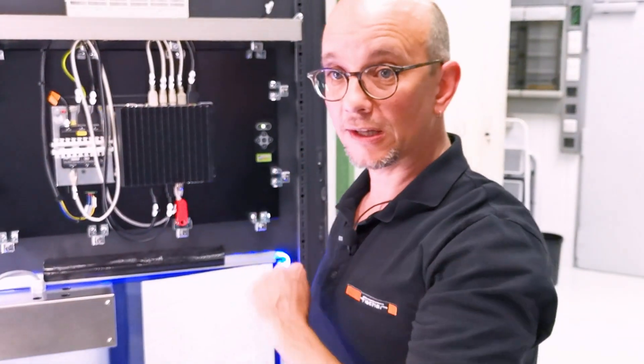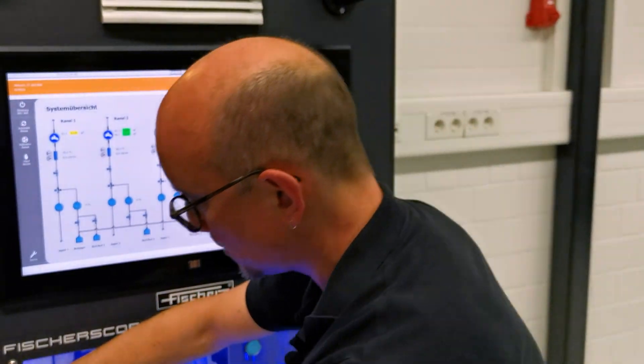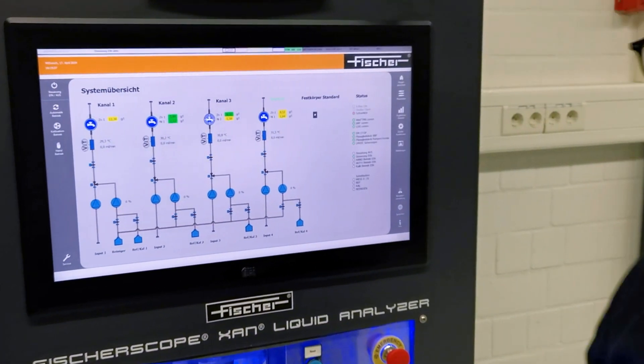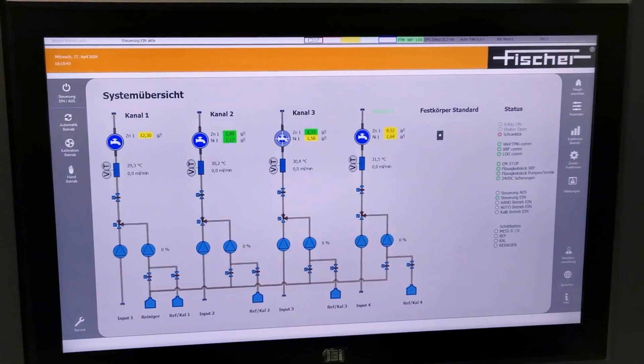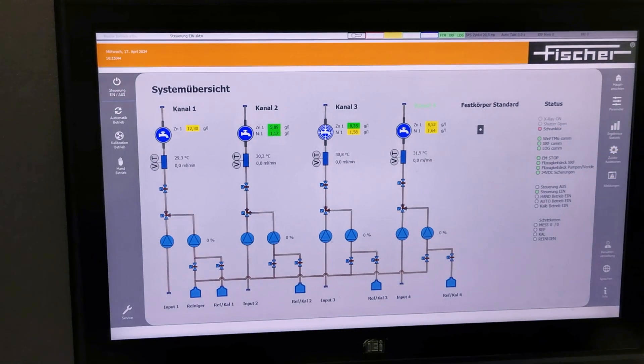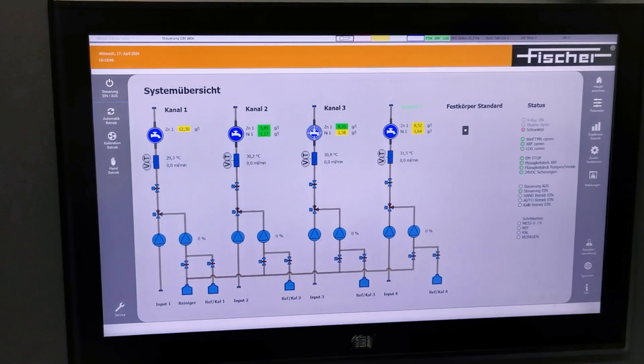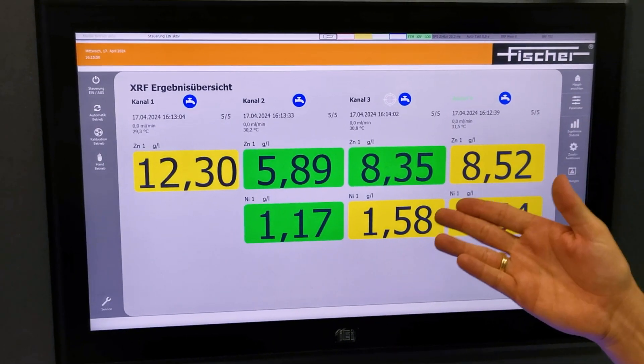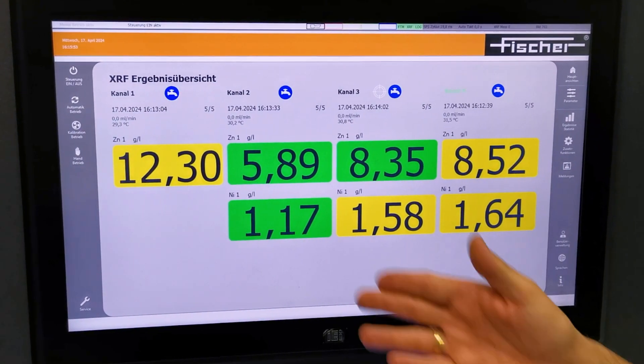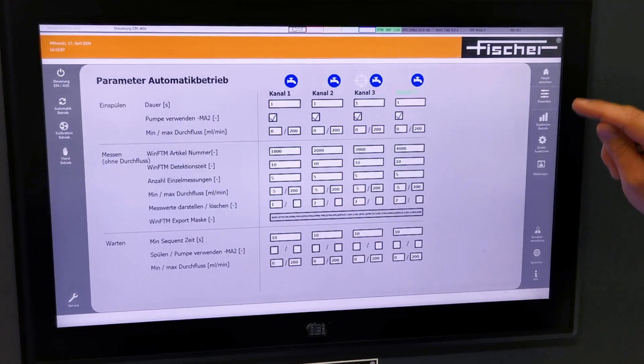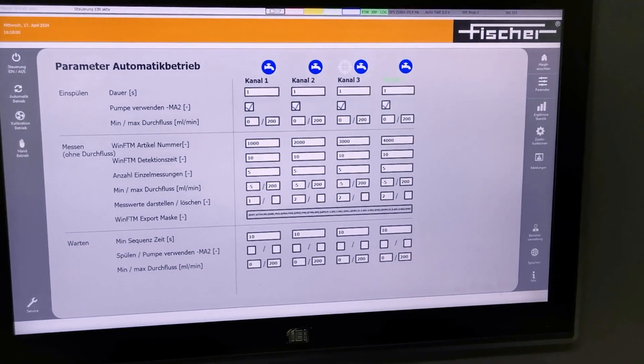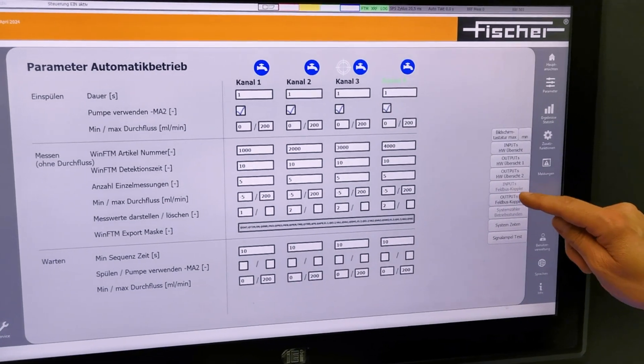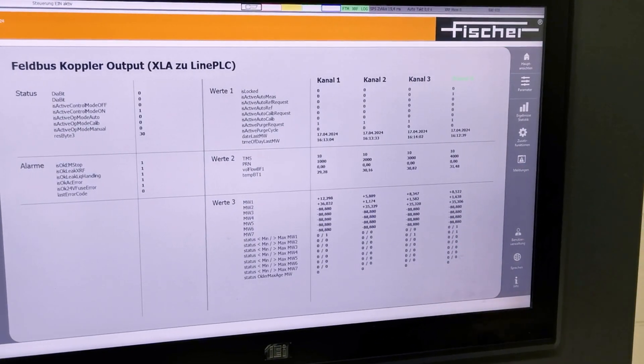Now I would like to show you the software side. The software is designed for a self-explanatory look and feel. We have a large view in the middle showing you different main views: the hydraulic scheme, real-time results with color identification for all four channels, one set of automatic parameters per channel, and furthermore, field bus coupler output values.